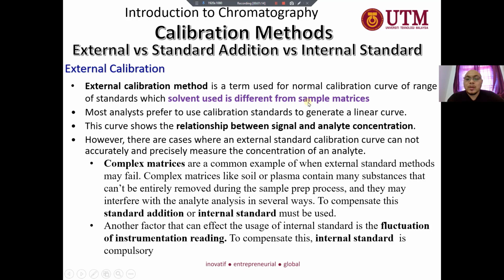It means when we do the calibration curve and prepare our analyte, we use solvent. So we don't use sample matrix to prepare our analytes.